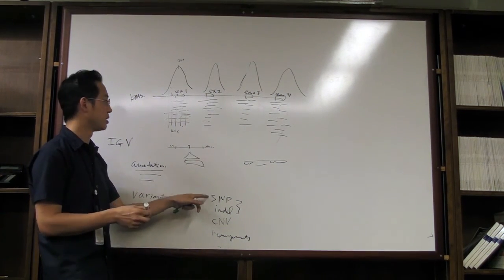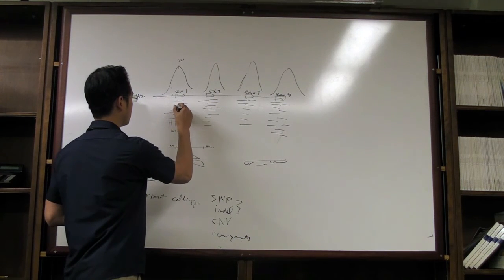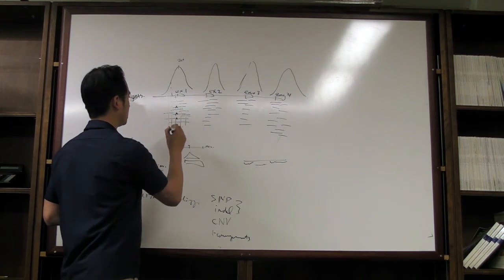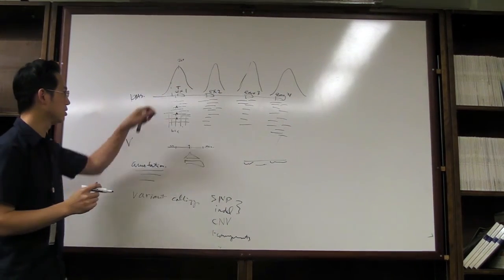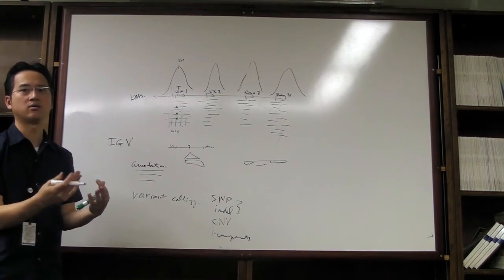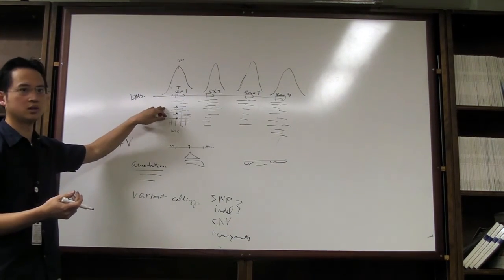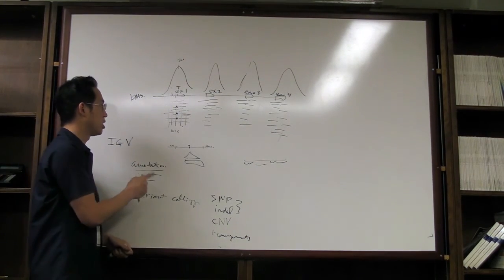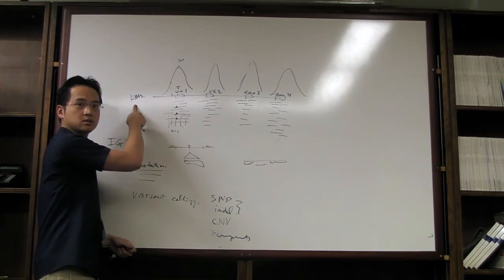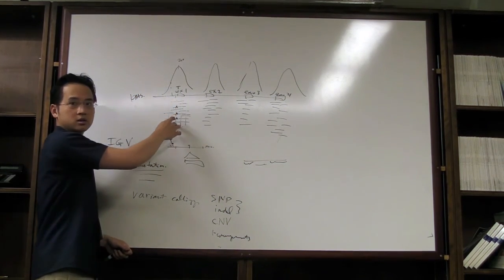SNPs are easy, right? So let's say I have a SNP here. I have several reads here that are showing A, but my reference is a T right there. So you do your variant calling, and it can spit out the frequency, how many reads show an A, how many reads show a T, what is the reference. And thereafter, when you annotate it, you'll know now that, oh, it's KRAS, it's in exon 1 at a certain position, it's a T to an A mutation.